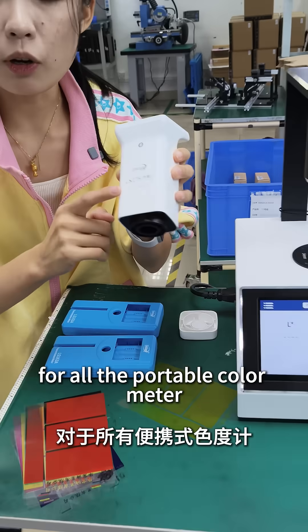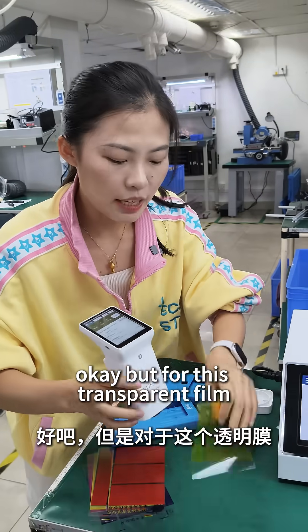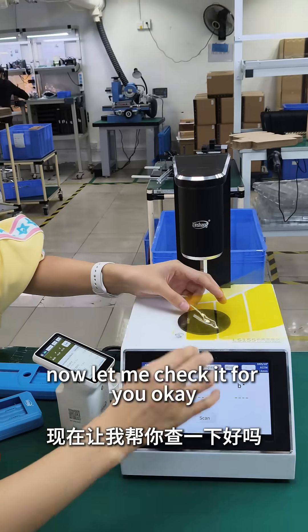For all the portable colorimeter, you can only measure the solid color like this, okay? But for this transparent film, you can use this LS155 color hazemeter. Now, let me check it for you, okay?